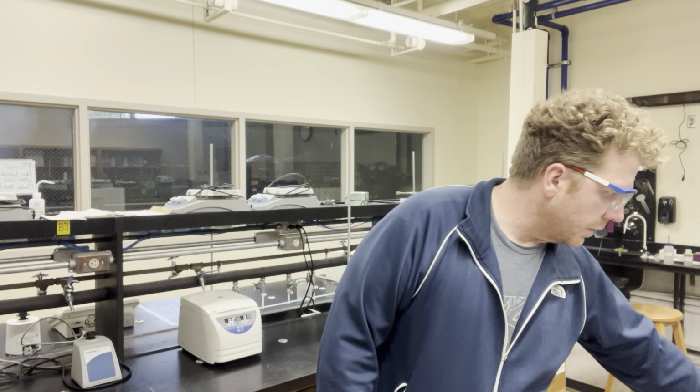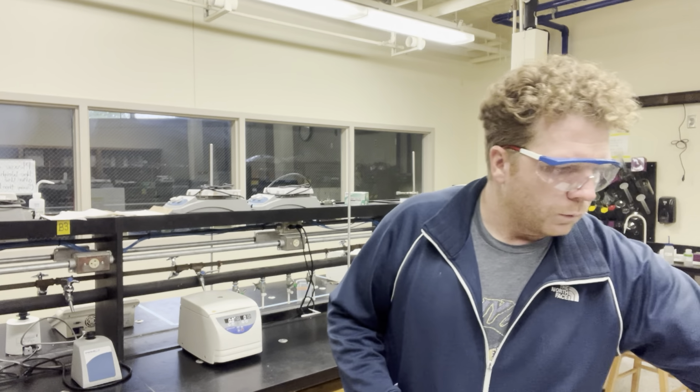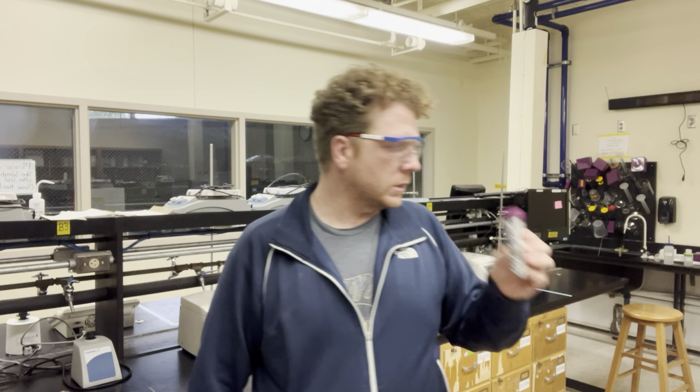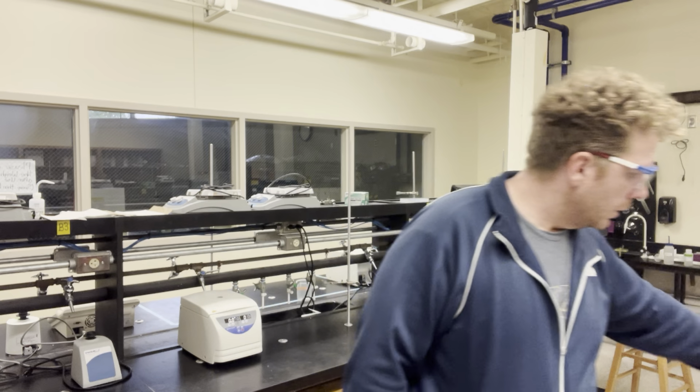In order to complete these experiments, we need a couple of things. One, we need a purified enzyme. And I'm going to be supplying y'all with that purified enzyme, or the sample that you're going to use that has your purified enzyme. In addition to that, we need our CAPS buffer, so the ideal buffer for our enzyme catalyzed reaction. We need fresh NAD plus solution, and we need some sodium lactate. So those four different components are all going to play into our experiment.